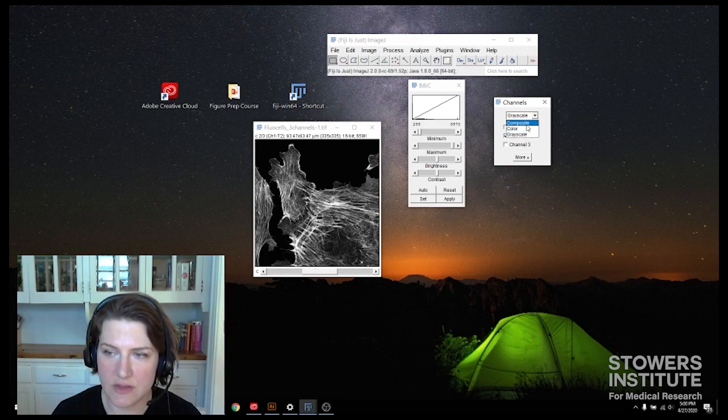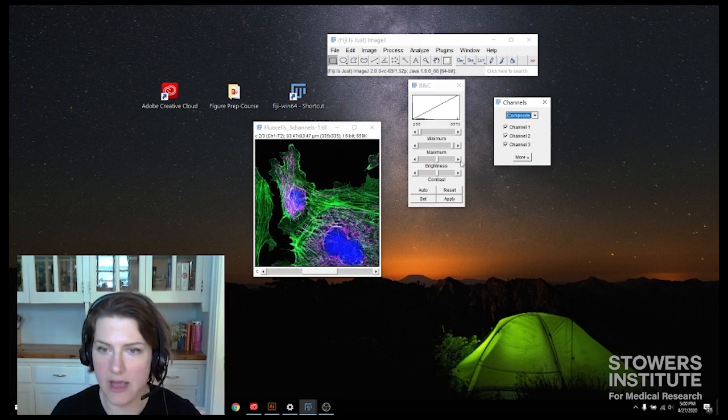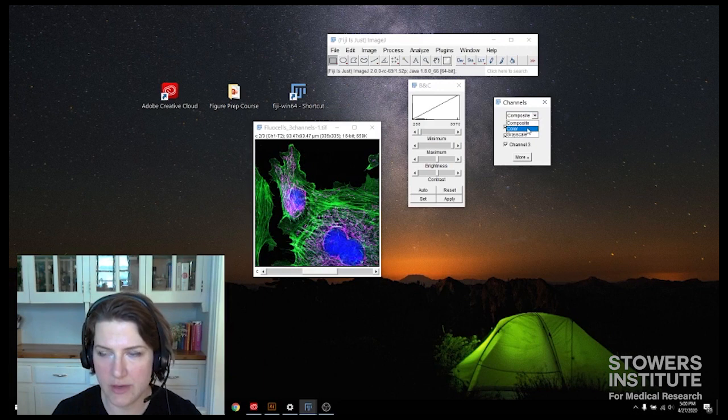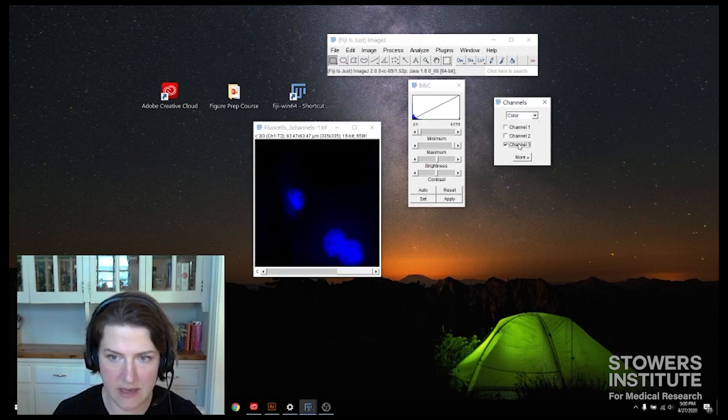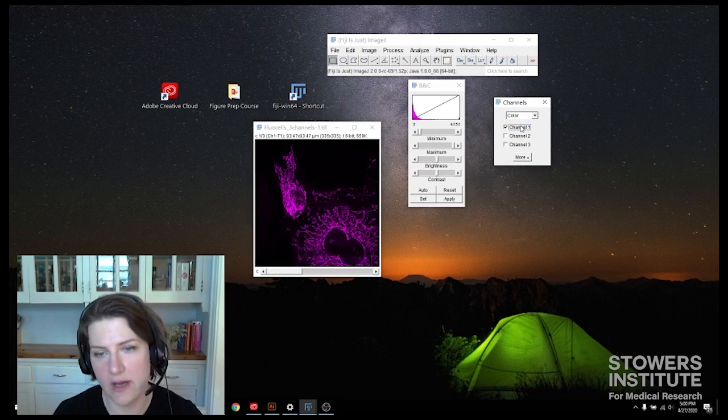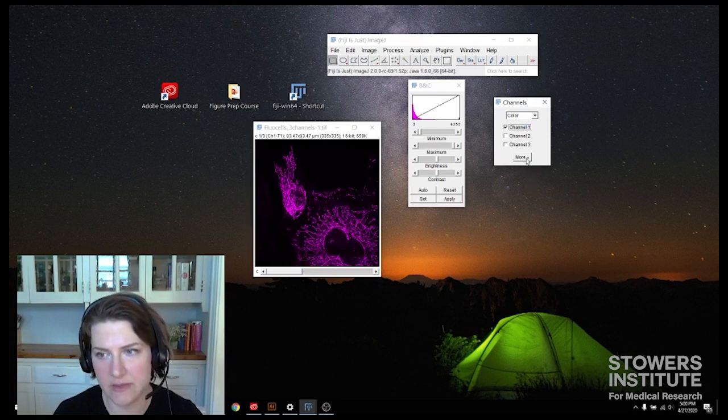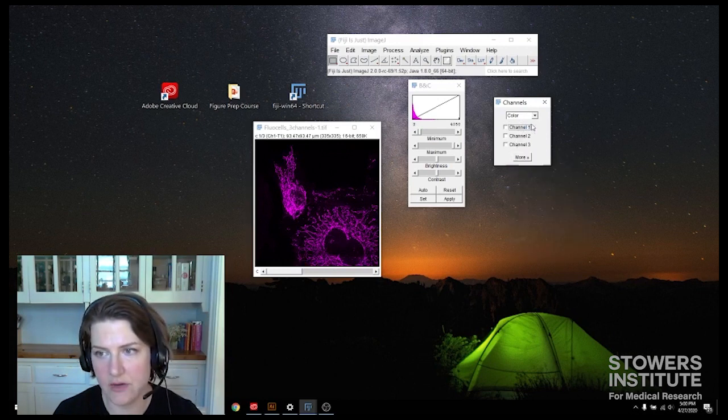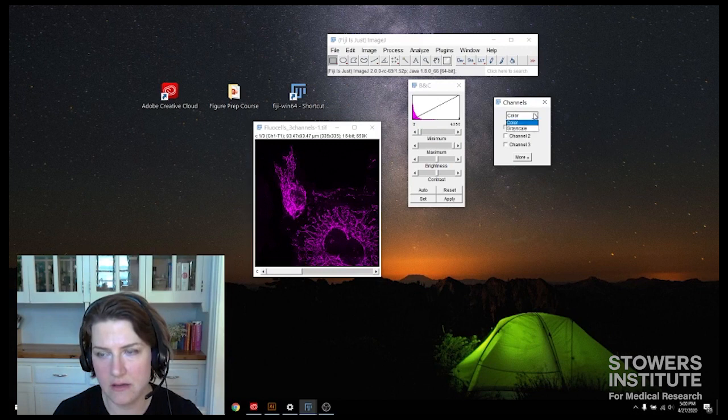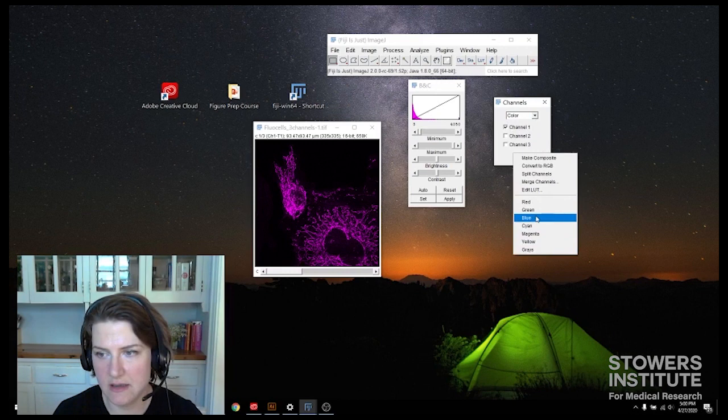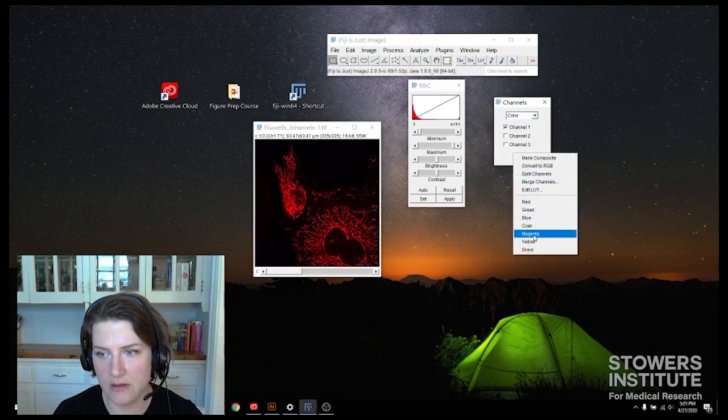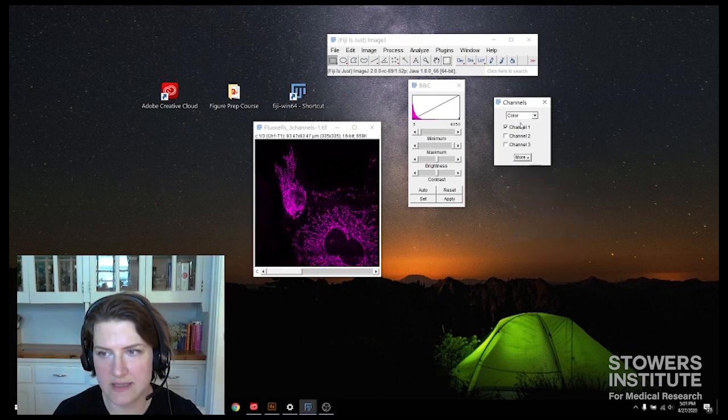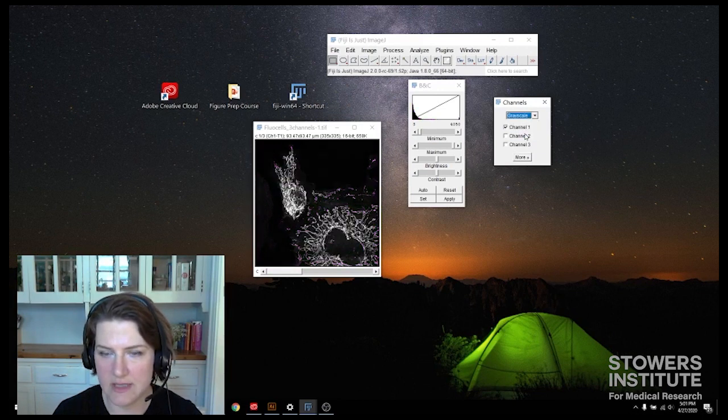So let's go back and oh, there's one more thing I wanted to point out. An easy way to change your channel colors. So say that you had originally acquired channel 1 in red and you wanted it to be magenta, is if you're in color, have channel 1 selected, then you can change the color under more here. That's a fast and easy way to do it. All right, but we're not going to do that, we're going to go to grayscale.